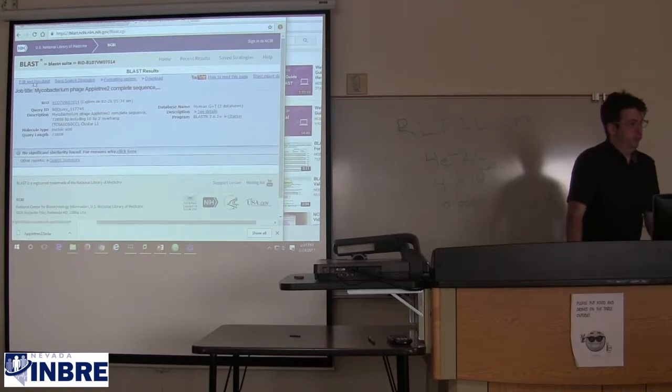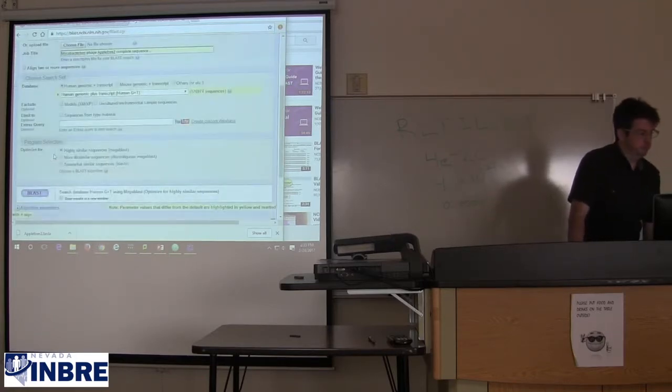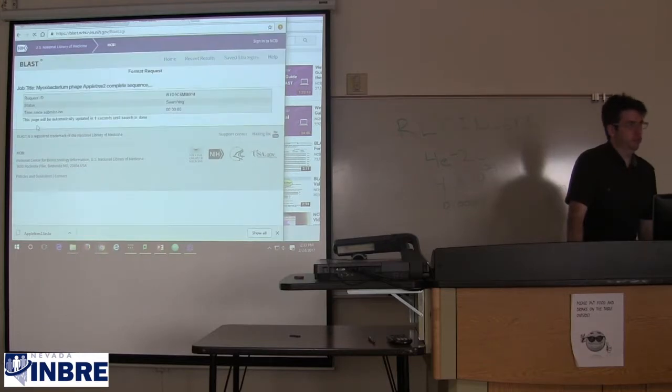Let's edit it one more time. Let's change our algorithm. Let's see if we use the more sensitive plain old Blastn, and let's do that search. It should still be pretty fast because it's only doing the human genome as opposed to the trillion letter database that is in our NR. Trillion might be too small of a number.